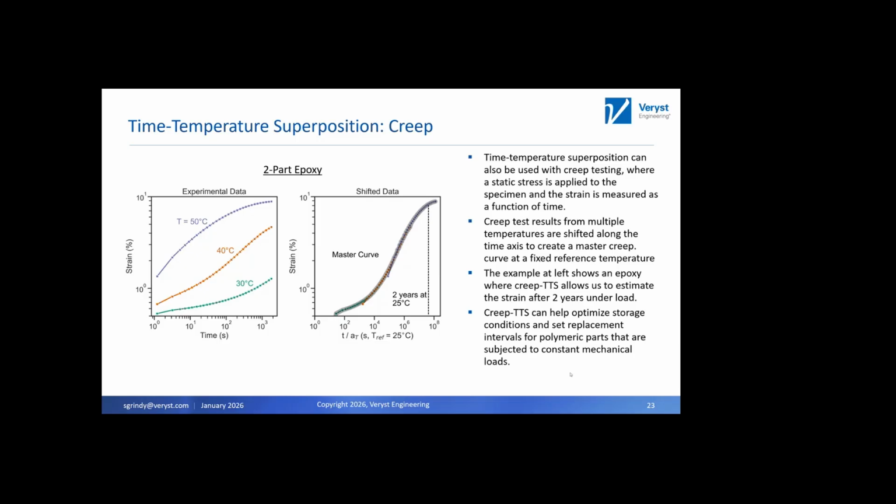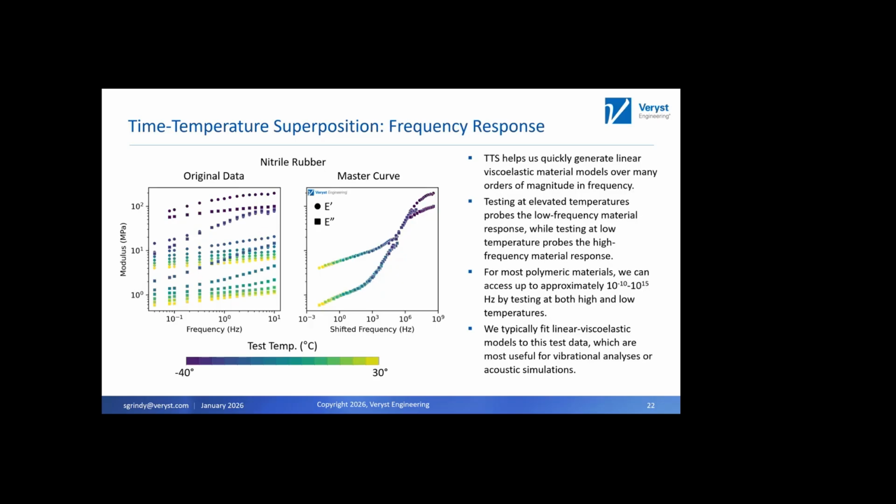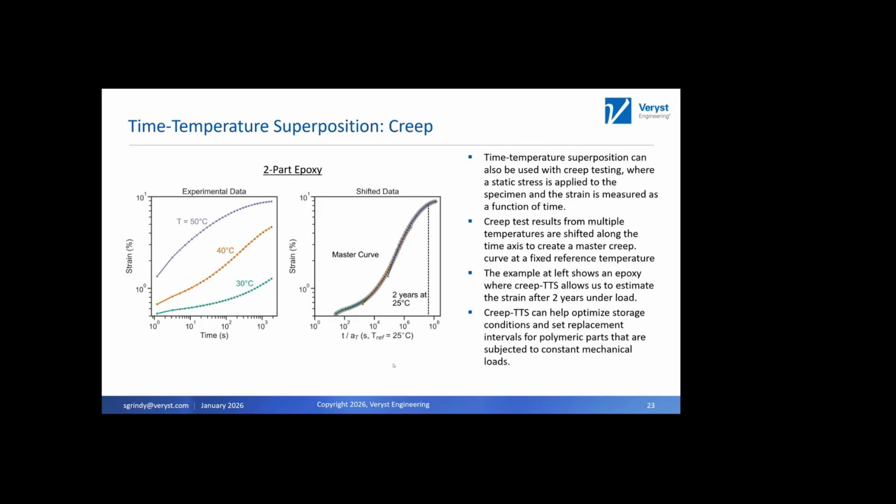Let's see, someone asked, how do you do the shift in slide 23? Is it a calibration procedure for materials? Yeah, so the actual shift, that's the right way to phrase this. If you just compare the 40 and 30C curves, for example, you can tell that we're going to shift the 40C curve to the right to make it so that the two curves overlap.